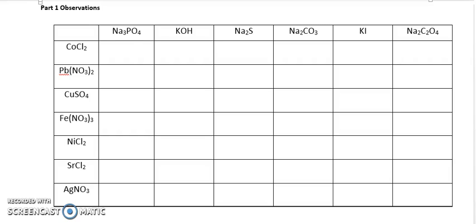Use as much chemical as you want. It's all sitting there waiting for you. And play. Just play with it. I know this part of it is really confusing, but I think if you just start to play with it, you might actually get the idea of what you're supposed to do for this part. So don't stop until you have a pretty good idea of what that chemical is, and make notes about the process that you used to try and figure this part out.